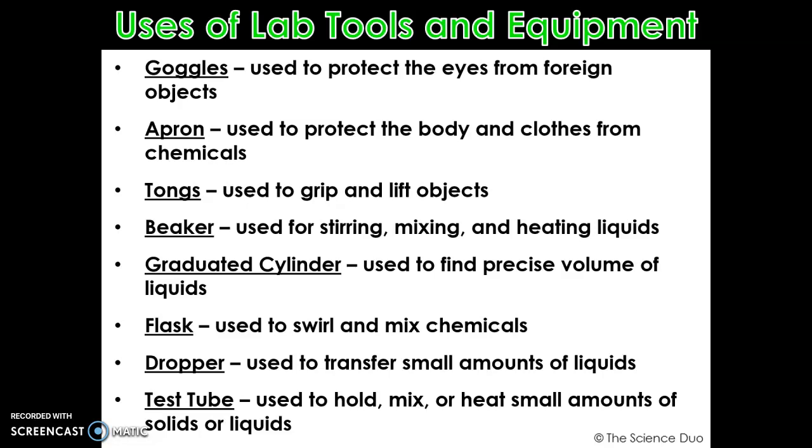If you're heating a test tube, obviously you don't want to touch it with your bare fingers because if it's hot, you could burn yourself. So that's just common sense safety. You don't want to touch hot glassware. And also, fun fact, you can't tell if glassware is heated just by looking at it, because cold glassware, warm glassware, and hot glassware all look the same. So if you're ever back in a regular lab and you're not sure if something's hot, assume that it is and don't touch it.